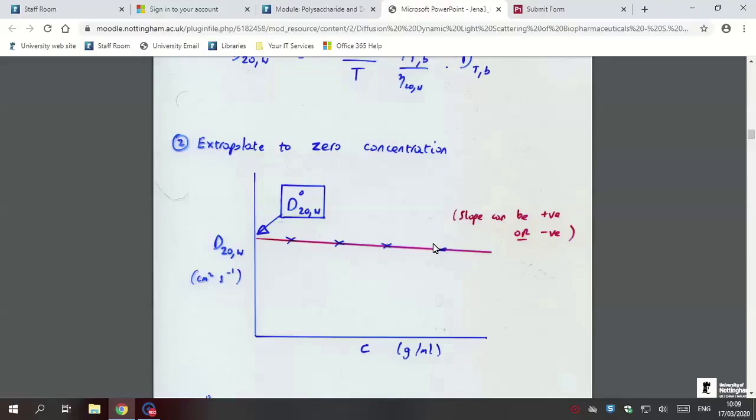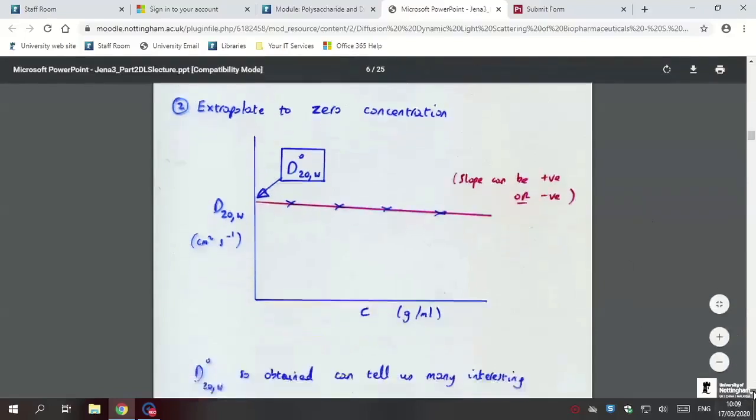There's a lot of interest now with the theoreticians as to what happens at very high concentration antibody solutions, and when you look at it with dynamic light scattering. But conventionally you extrapolate back to zero concentration, but it's not as critical with dynamic light scattering. That's one advantage of the technique.